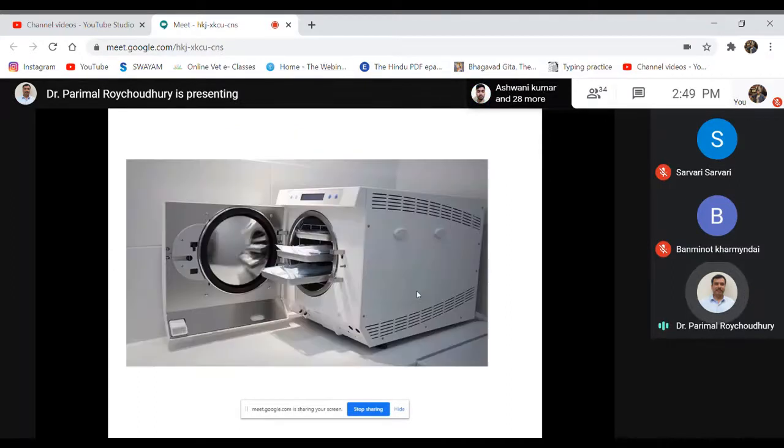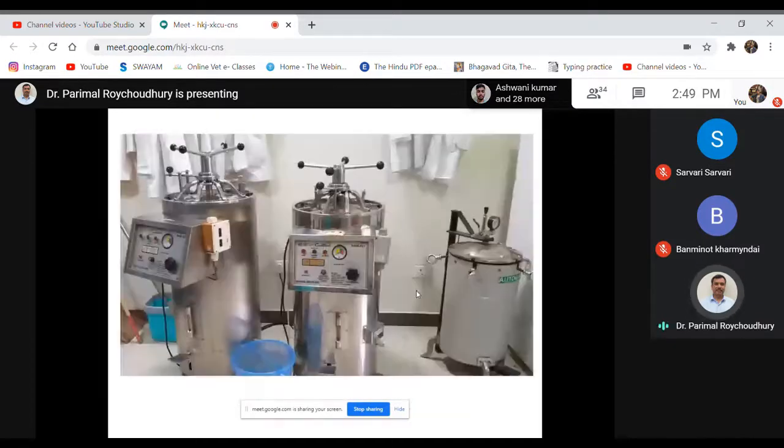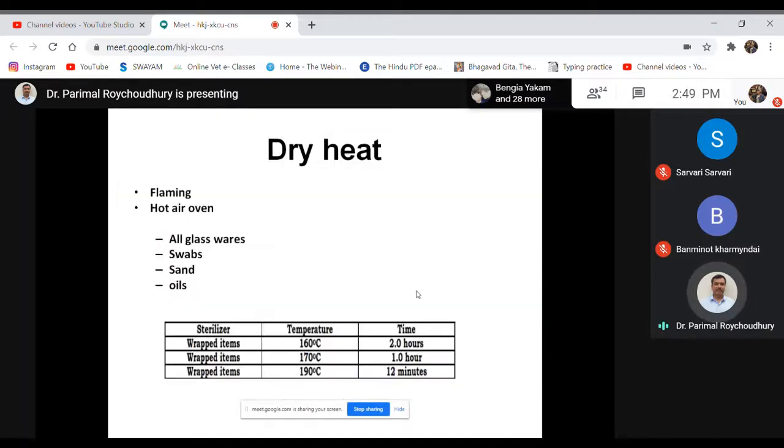Now, if I shortly recollect what basically happens in the dry heat type of sterilization, how the organism gets killed: once it is heated, the temperature increases, and all the moisture present inside the bacteria or the spores will evaporate. Of course, the spores contain very little, but everything will dry off. After that, when the temperature goes up to 160 degrees centigrade, all the surface proteins and structures will virtually be destroyed. As a result, the organisms get killed.